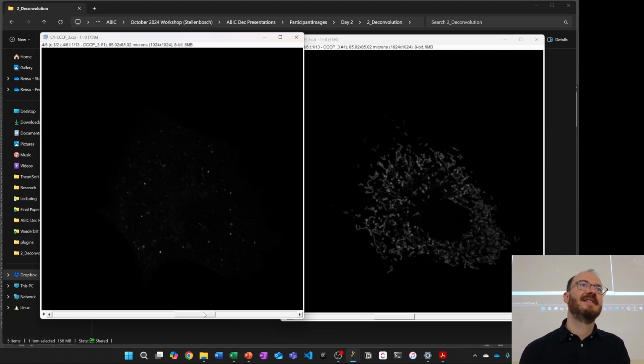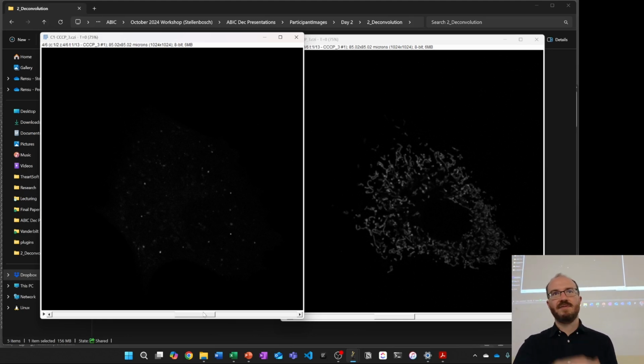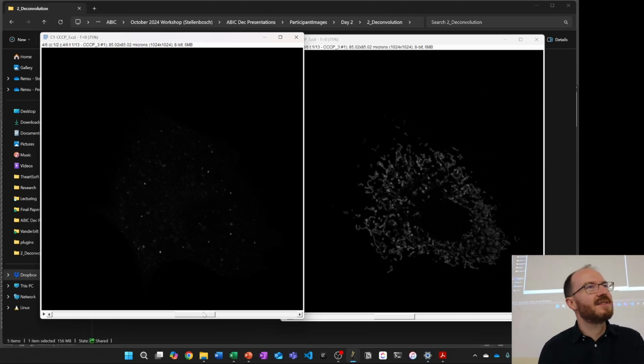But if you have a single image, you still have distortion. But then you would remove it with other, yeah. I'm not entirely sure how you would go about doing that, if you can just apply deconvolution as if it's just one layer. The reality is if you just have a single image, you actually have no depth information. That is all flattened. It's like a maximum intensity projection, essentially, or average intensity projection. But you can probably still get rid of some of the blurring. I'm assuming deconvolution. I've just never had a situation where I had to apply it to a single two-dimensional image, so I'm not really sure.